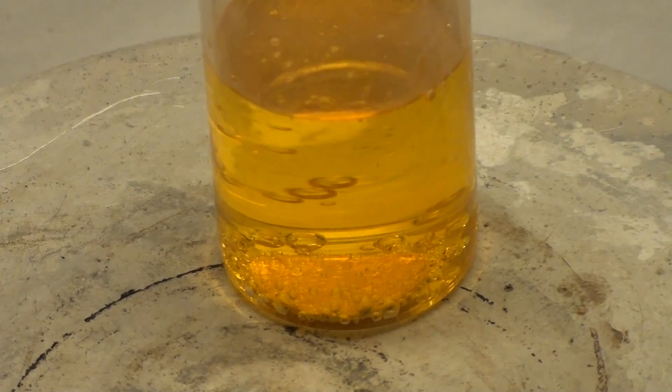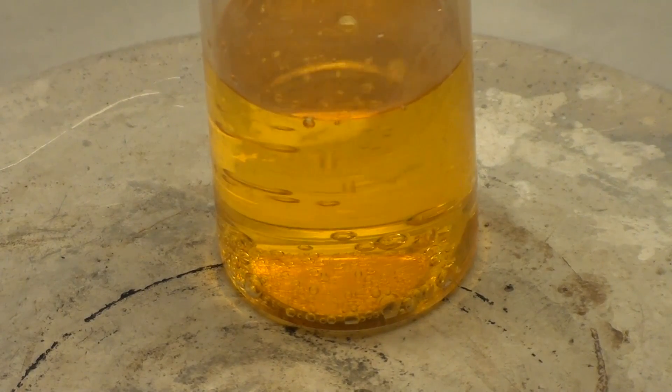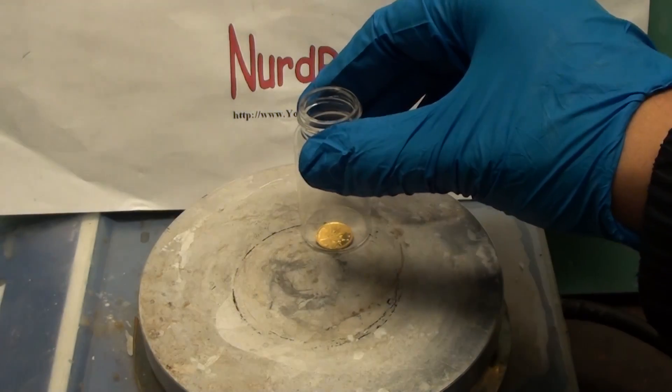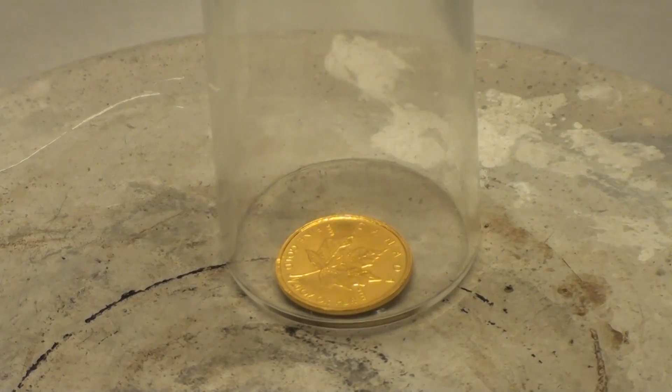Greetings fellow nerds. In this video we're going to dissolve a gold coin in acid. Here is the coin. It's a 1/20th troy ounce Canadian maple.